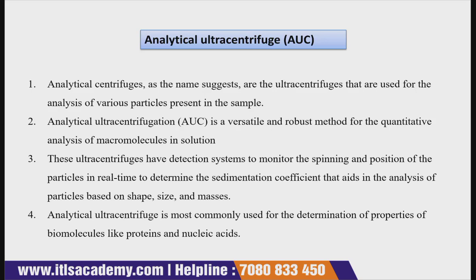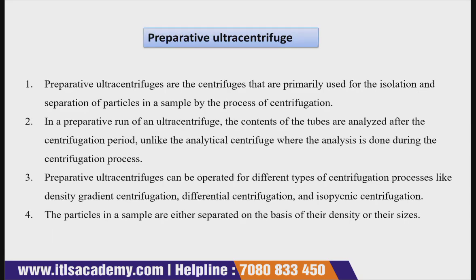And they determine the sedimentation coefficient. Whenever they are determining the sedimentation coefficient, it aids in the analysis of particles on the basis of shape, size and masses.